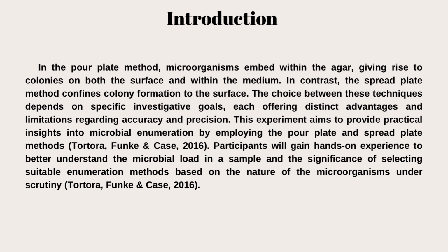This experiment aims to provide practical insights into microbial enumeration by employing the pour plate and spread plate methods. Participants will gain hands-on experience to better understand the microbial load in a sample and the significance of selecting suitable enumeration methods based on the nature of the microorganism under scrutiny.